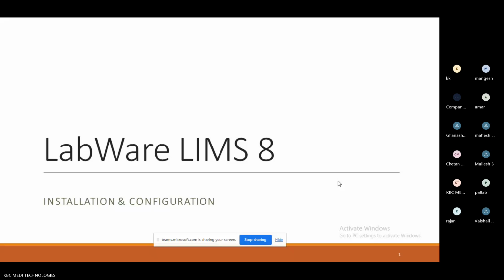Okay. And when it comes to the training part, first of all, I hope you all are aware what topics we are going to discuss during this training. The team already elaborated on them, and just for your understanding purpose, I am recollecting the same information. First one is master data.